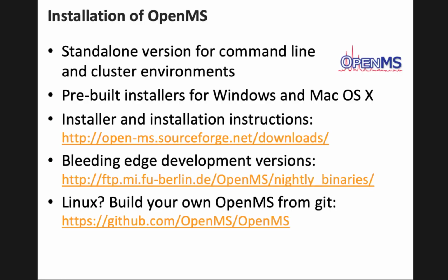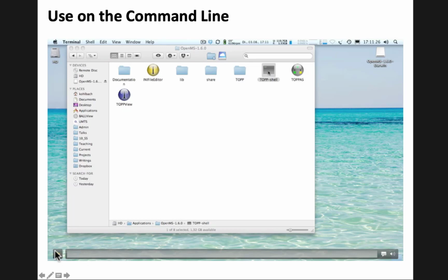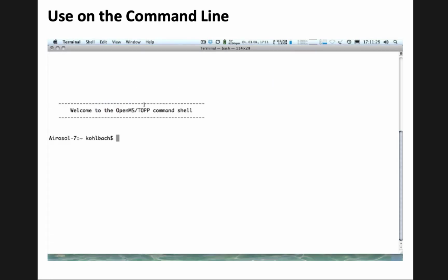Installing OpenMS is relatively easy. You have these USB keys. I hope you tried it out already. And once you've got that running, then you can use it on the command line. And this here is just an illustration of how you can also work with these tools.